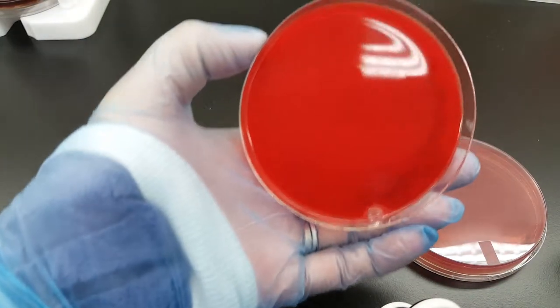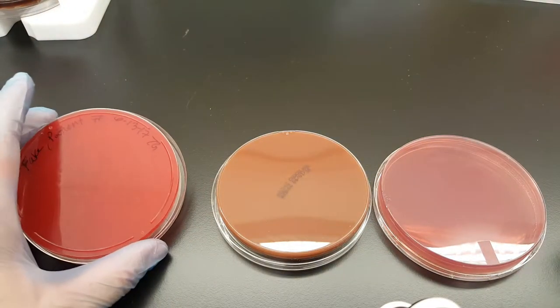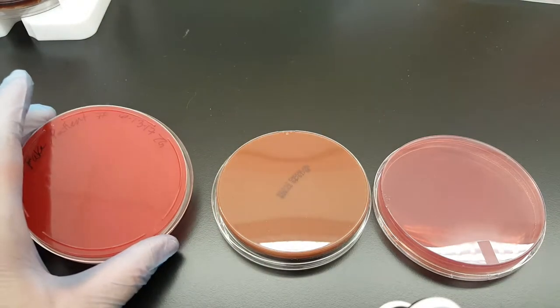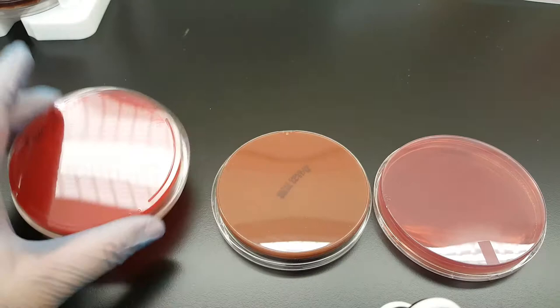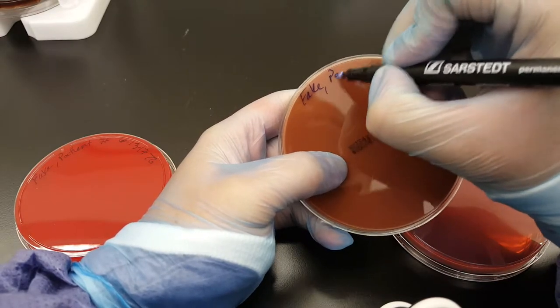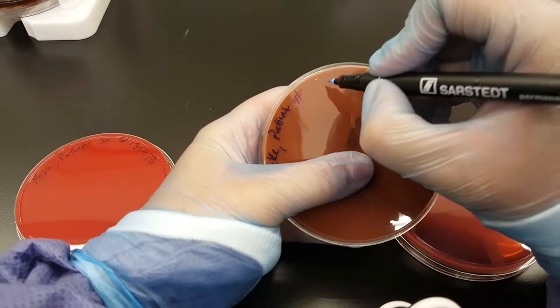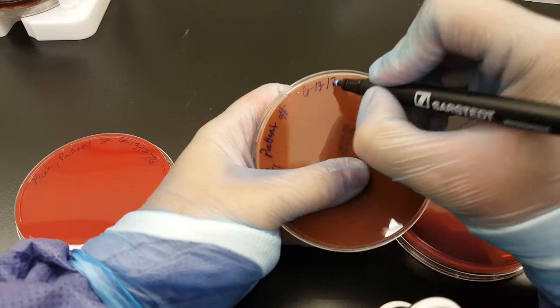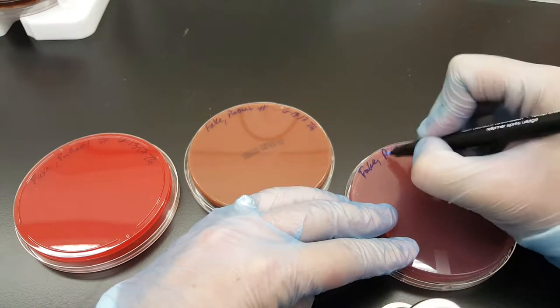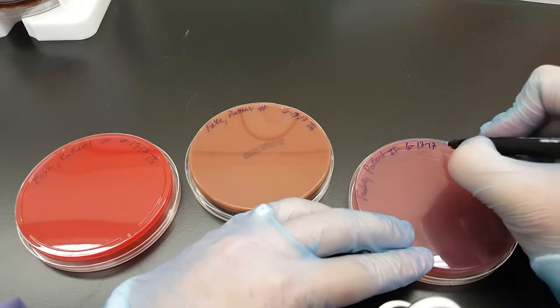Notice that you can kind of see it through the plate — if you held it up to the light, you most likely could. But we keep it on the rim so that the growth of the organism, if there's hemolysis or anything, there won't be writing in the way when holding it up to the light. So again, to summarize: last name, first name, the medical record number or the unknown number I give you in class, then the date and your initials.